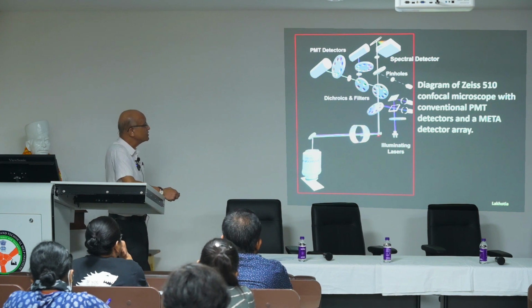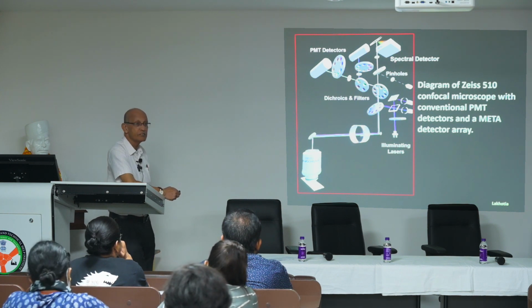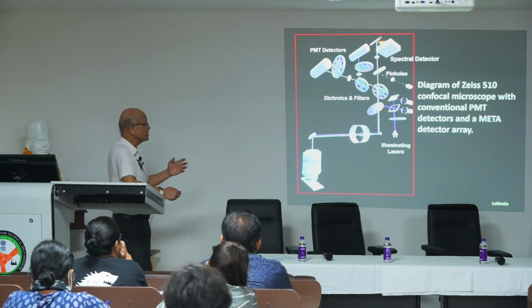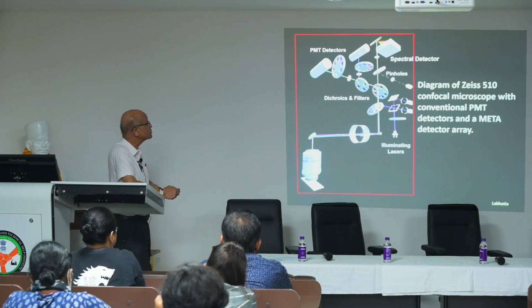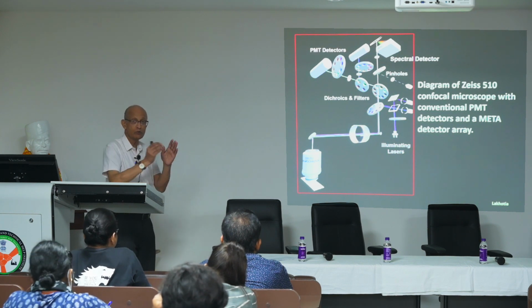But then whether light will go to which one, you can control these different filter wheels. The software allows you to identify which filter wheel to use for which kind of barrier filter, which kind of excitation filter, or a dichroic for reflection. And accordingly, you can decide that light generated on this particular wavelength will go to this photomultiplier tube. A fluorescence generated, for example, this blue one will go to this, red will go to this. That can be determined using the software.